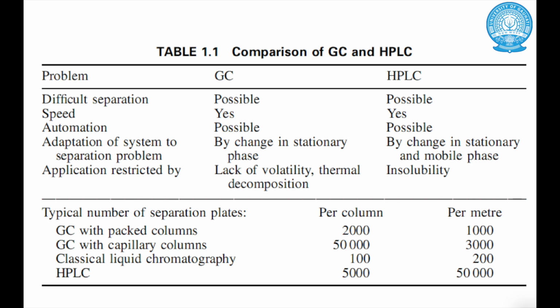So non-polar compounds will have longer retention times in a reversed phase column, whereas polar compounds will have shorter retention times when they are eluted through a reversed phase column, C18 column. So similarly, other extracts can be also seen in this context.